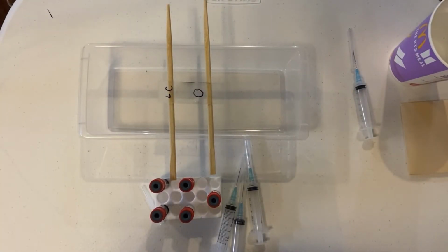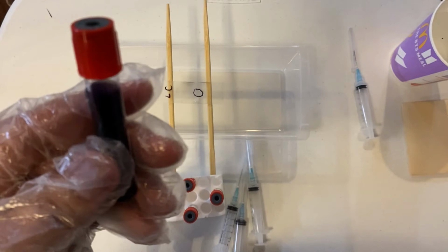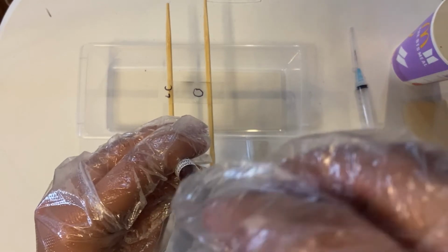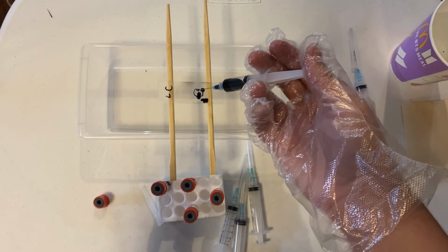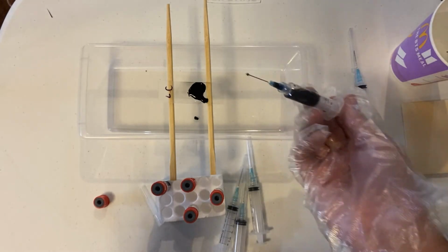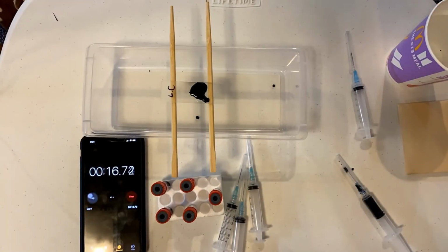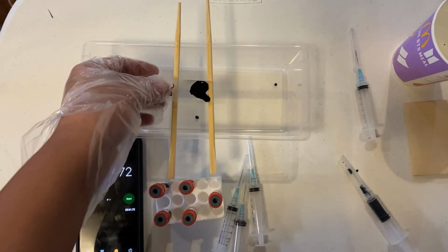Now, we will proceed to staining. First, we use a crystal violet dye. This will determine if an organism is gram positive. And we gently press it on the slide. The stain will remain on the slide for at least 30 seconds. After staining it for 30 seconds, we wash it with distilled water.